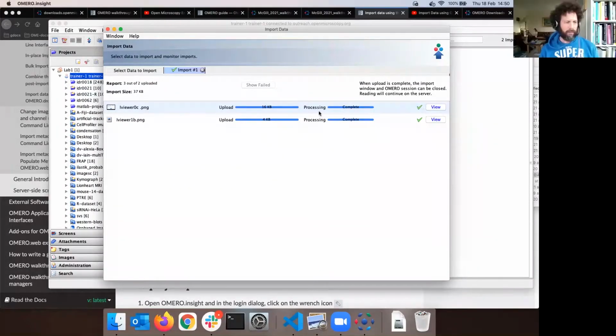Okay. Peter, you might just want to explain the usernames that we've all set up. A couple of people are confused that they've logged into someone else's account or something. Okay, that's great. We will do that in OMERO.web though, okay? Don't be confused. If you think that you did the right thing, then you probably did the right thing, okay?